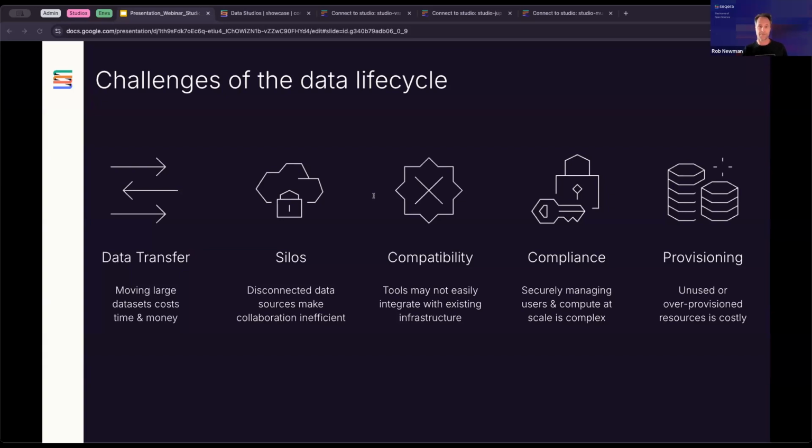Thirdly, compatibility. Analysis tools and libraries are often installed in an ad hoc manner per analysis session, and they're not necessarily pinned to specific versions, or there's no institutional level control or verified libraries or version-controlled collections of tools. This makes creating reproducible analysis environments extremely difficult and creates confusion and inconsistent results between different analysis sessions across teams.